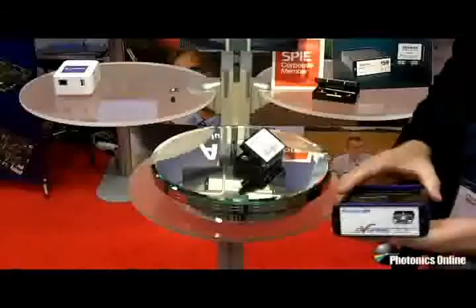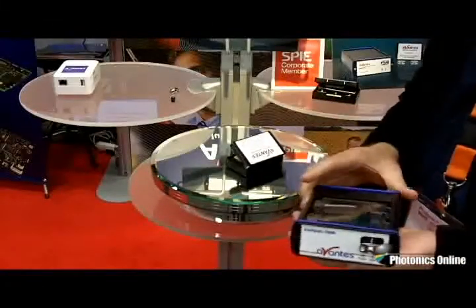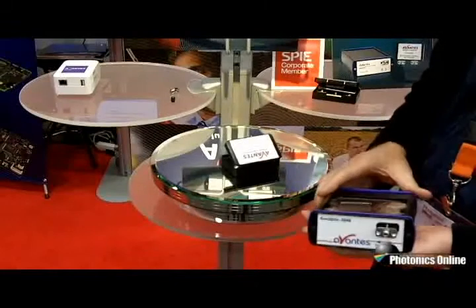I'm going to talk to you a little bit about our new RS feature AvaSpec spectrometer today. This is our AvaSpec RS series spectrometer. RS stands for removable slit.